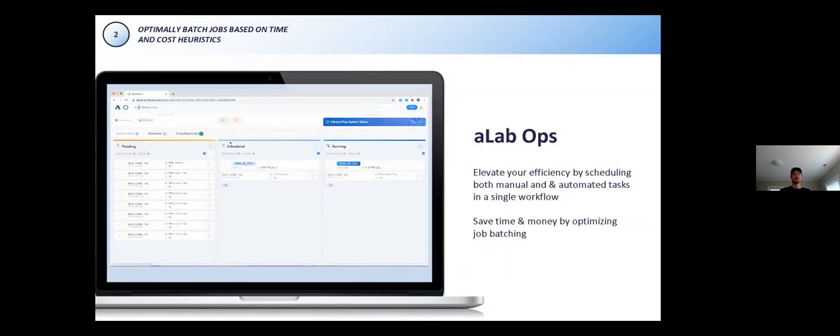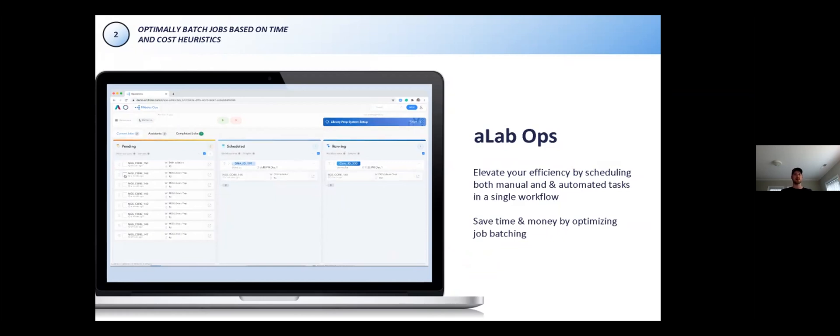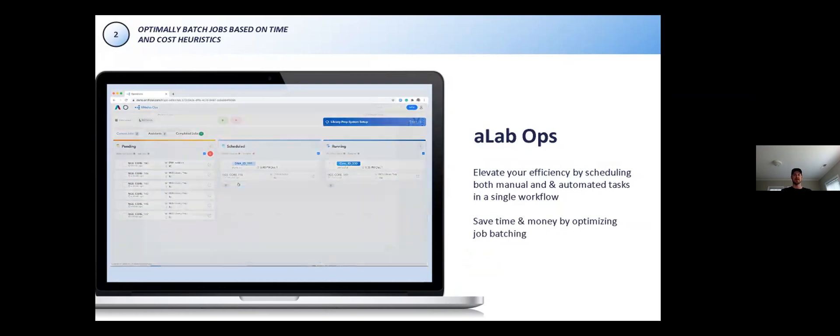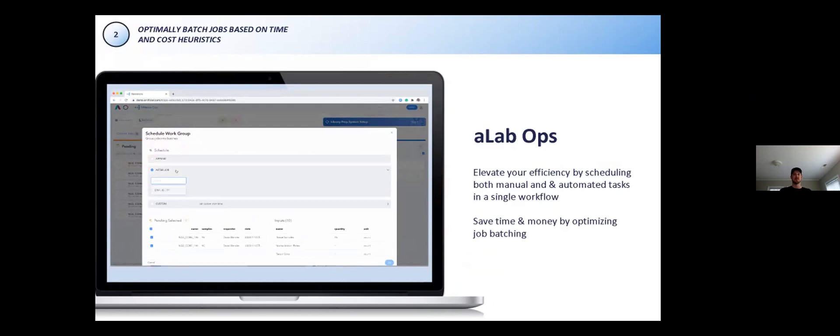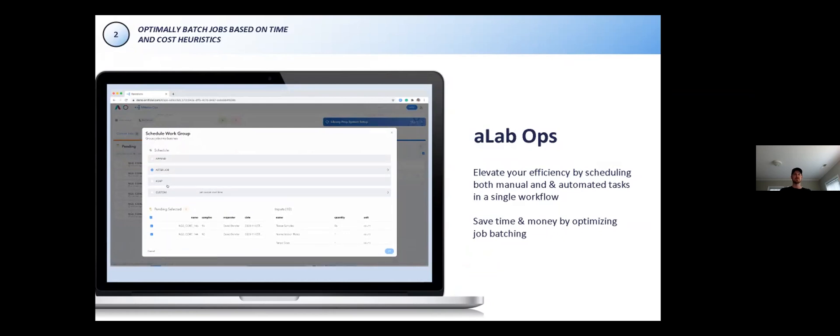Once a user has described their lab and protocols in A-Lab Suite, they'll want to actually run the process. The view for scheduling and running is our A-Lab Ops page. In A-Lab Ops, a user can view requests, which again are populated either from the LIMS or an ELN or manually. In this particular example, they were populated from BenchLink. A user can manually batch these requests or have our dynamic scheduler automatically batch them based on heuristics for time or cost savings.